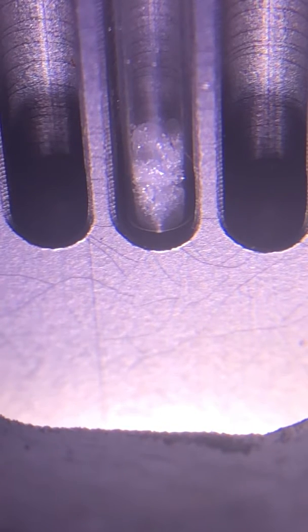For impure samples it's usually below the melting point and the range between the sweat and the melt is typically pretty large, which you're actually seeing as a freezing point depression that we talked about in Chem 1A. If you have an impurity mixed in your solid then the melting point goes down.